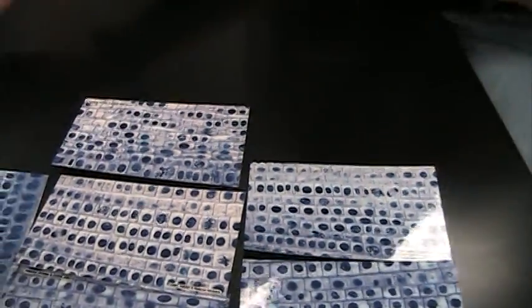I hope that helps you understand more about the different steps of mitosis. And like I said, you'll be identifying those going from cell to cell, deciding if it's interphase, prophase, metaphase, telophase with these plant cell pictures.